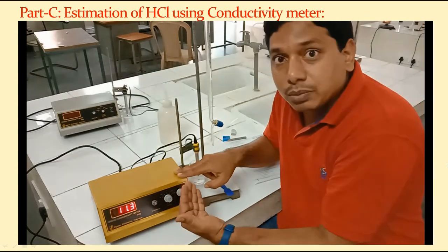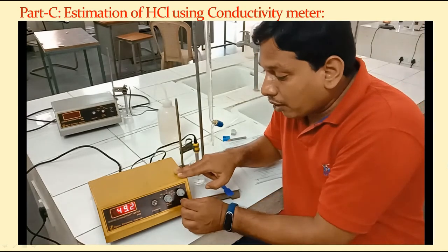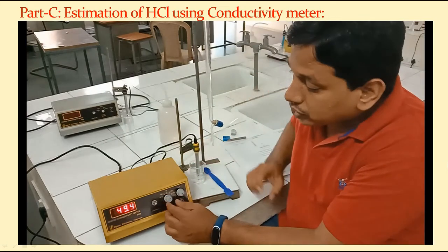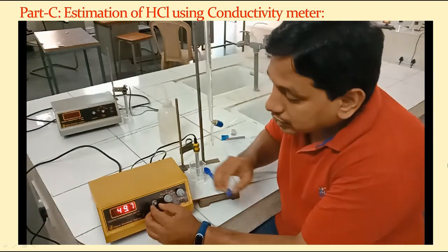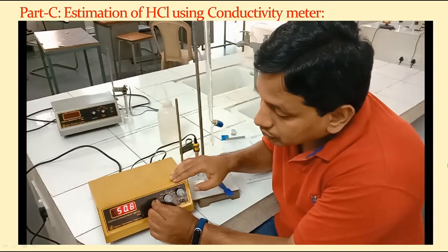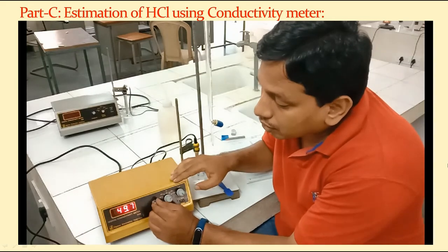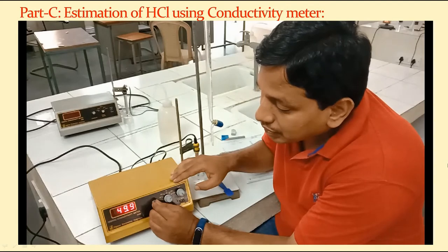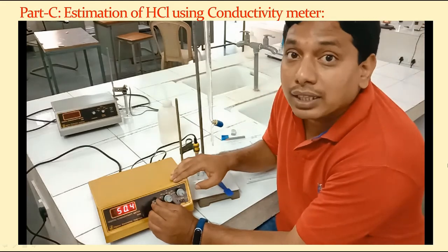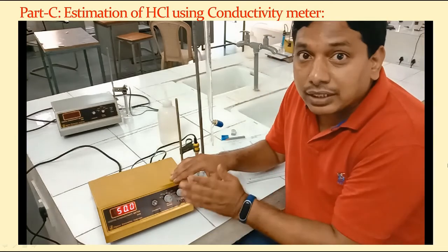Before starting the experiment, we have to calibrate the instrument in check mode. So let me keep it in the check mode now. As I'm using a strong acid, hydrochloric acid, I'm setting the range to 100K, and in this calibration I'm adjusting to 50. You can adjust to either 50 or 100. To minimize the errors, I am setting it to 50 only, because the usage of voltage is less, so there won't be any load on the capacitors and it gives accurate results. That is the reason I am adjusting to 50 instead of 100.